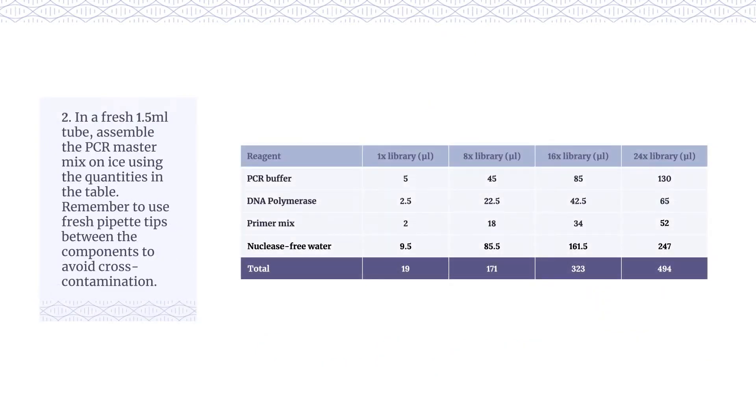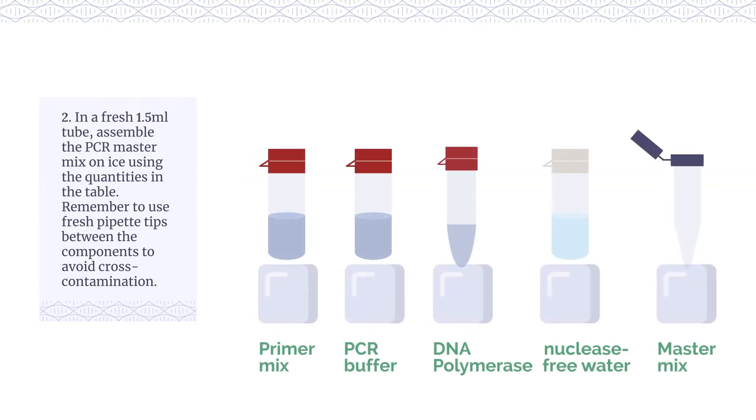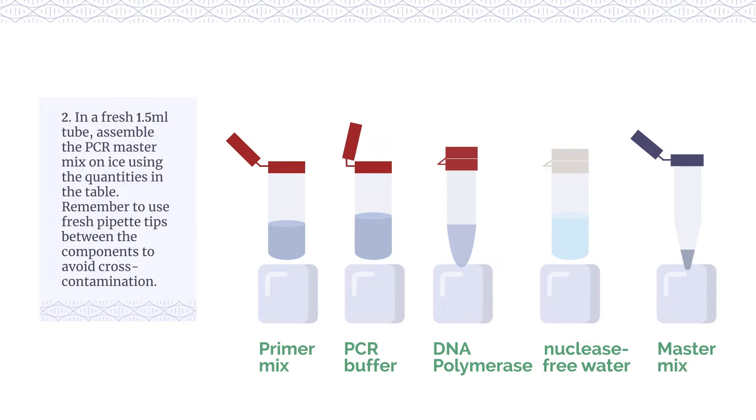In a fresh 1.5ml tube, assemble the PCR master mix on ice using the quantities in the table. Remember to use fresh pipette tips between the components to avoid cross-contamination.